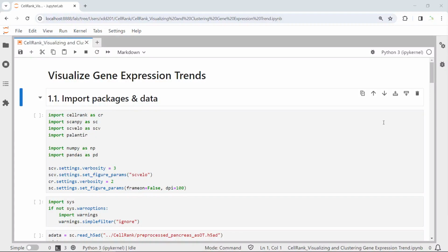Hello, everyone. Welcome back to my CellRank video tutorials. In today's video tutorial, I'm going to show you how to visualize gene expression trends.